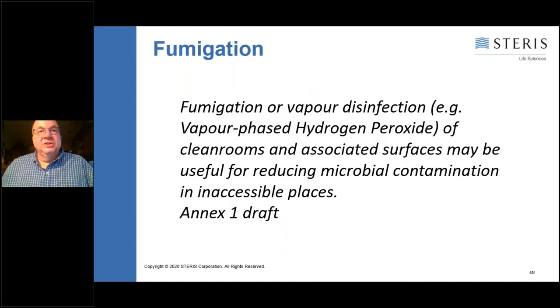And as it mentions here in Annex 1, the use of vaporized hydrogen peroxide can certainly be used in clean rooms and on associated surfaces to help reduce microbial levels. I know in the US we see a lot of it used, and I often recommend it when you have a big fungal spore outbreak or a big bacillus outbreak that needs to get contained.